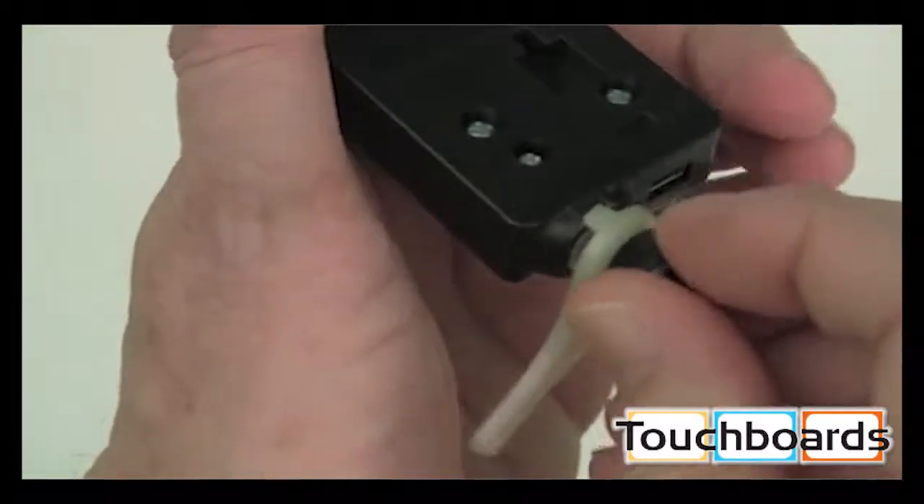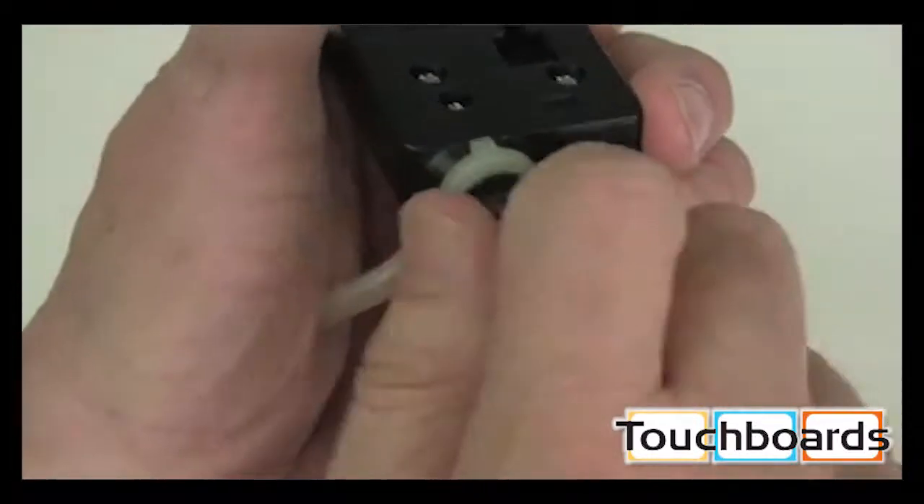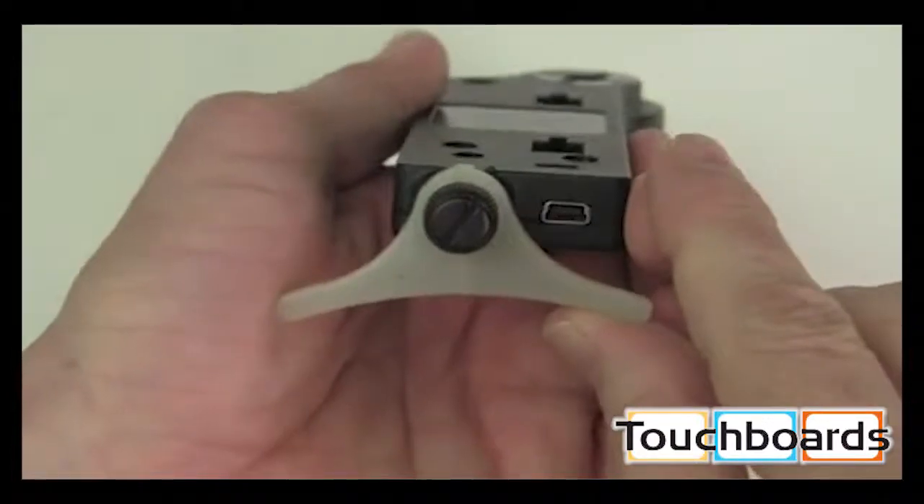We also provide a simple yet unique stand so that you can lay your ProScope MicroMobile on a flat surface for a steady and sharp focus.